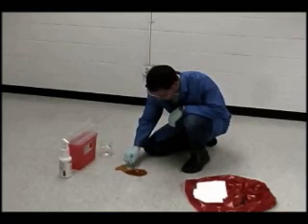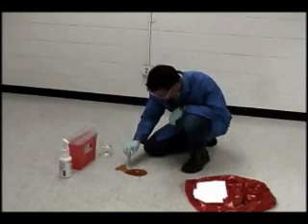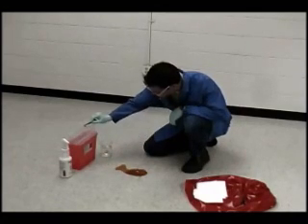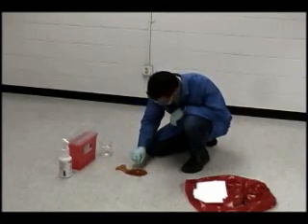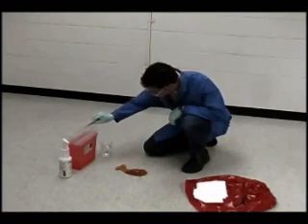Before cleanup begins, be sure to secure the area and keep unauthorized personnel away. Remove any broken glass or sharps from the spill using mechanical means, such as forceps. Never remove sharps or broken glass by hand.